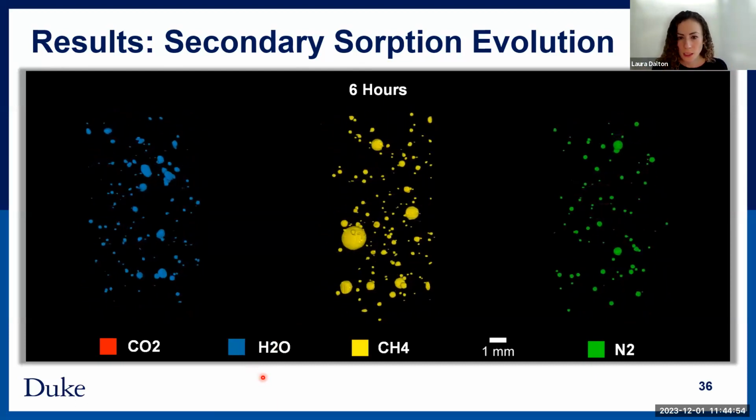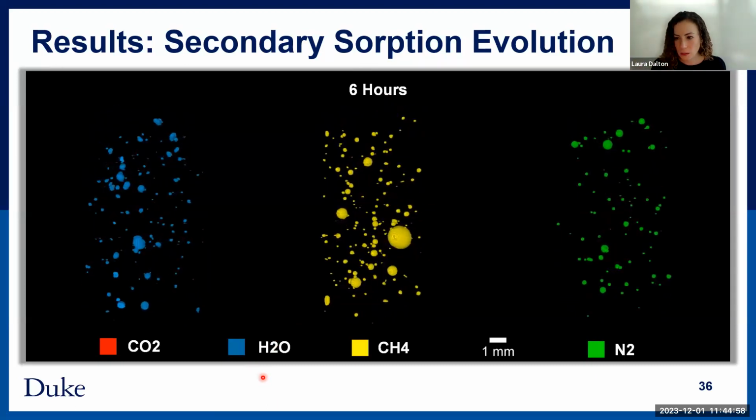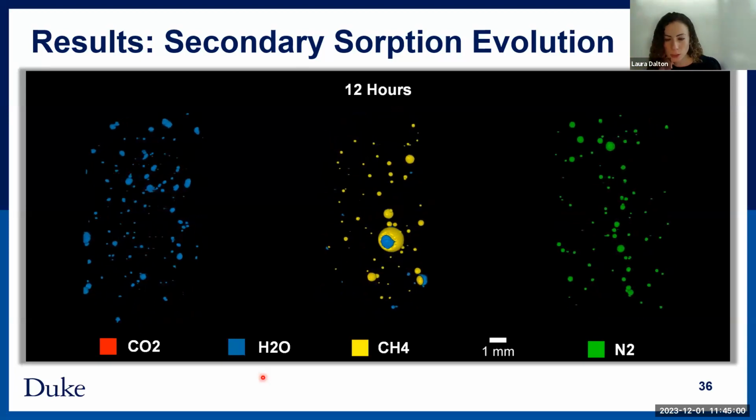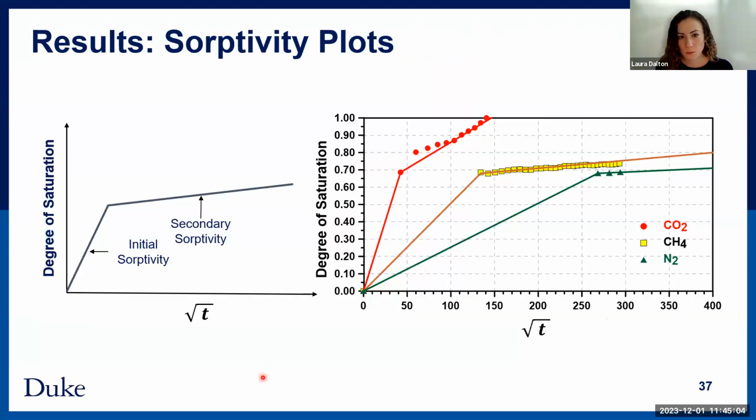And then it isn't until around 12 hours that I saw a change in methane. And even during that whole 24-hour period, really didn't see a change in nitrogen. So we can move on.